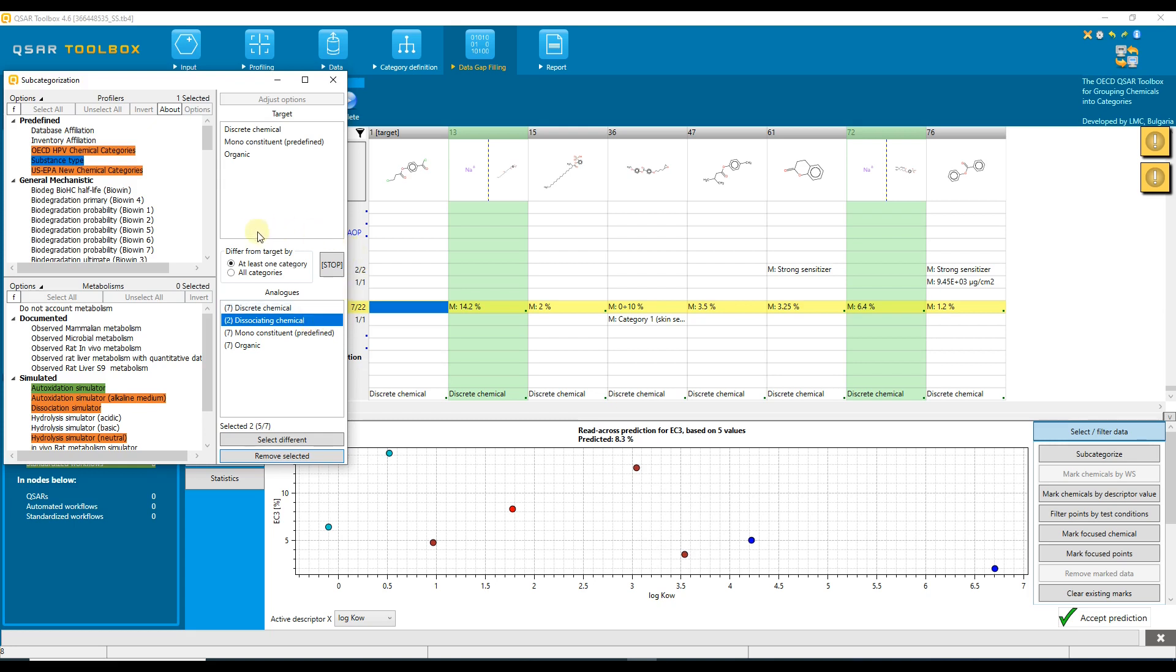Two additional options control the highlighting of the differences listed here. At least one category, which is selected by default, means that the system will highlight as different the chemical having at least one different category compared to the target chemical.